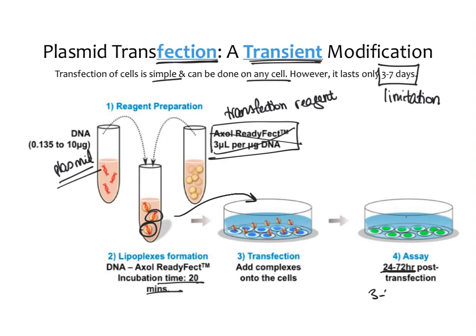But again, this will only last 3 to 7 days. So it's very important to get your experiment done. This is great for short-term experiments, sort of quick modifications. You just want to make a modification, see what it does, and then you're done with the experiment.